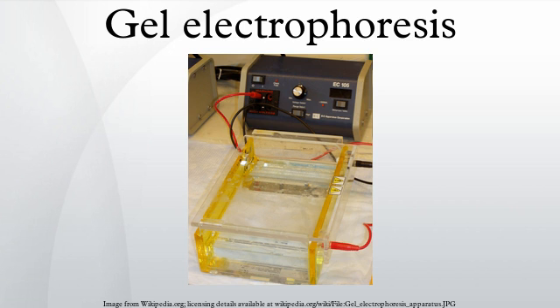LB is relatively new and is ineffective in resolving fragments larger than 5 kbp. However, with its low conductivity, a much higher voltage could be used, which means a shorter analysis time for routine electrophoresis. As low as 1 base pair size difference could be resolved in 3% agarose gel with an extremely low conductivity medium.